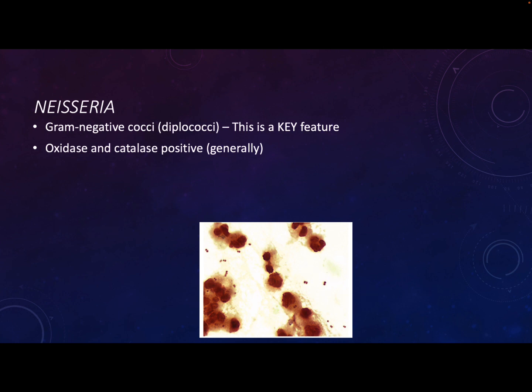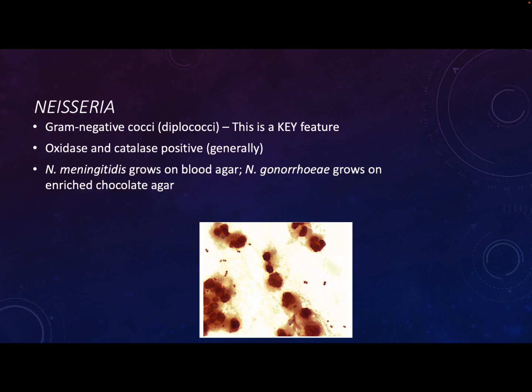So you could do a couple of different biochemical tests for them. And remember, these are great biochemical tests. I like these two because they're fast. You don't have to incubate them overnight and see a color change, right? You add a reagent, you see the color change right away. You add a reagent, you see bubbles right away. So they're fast biochemical tests.